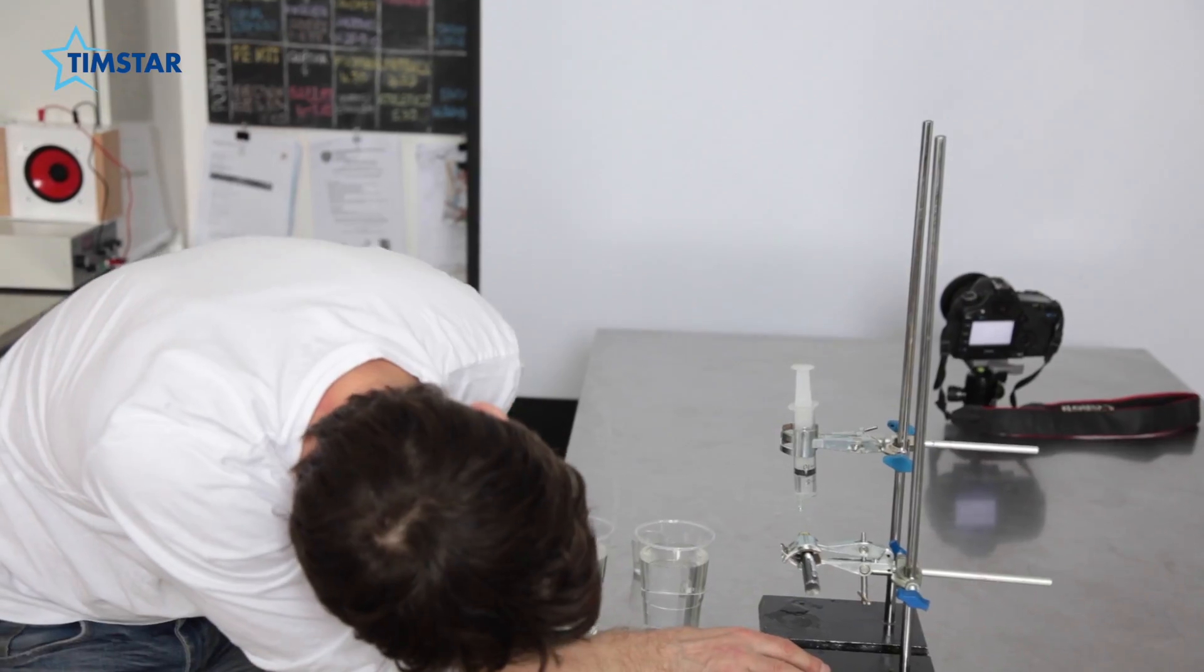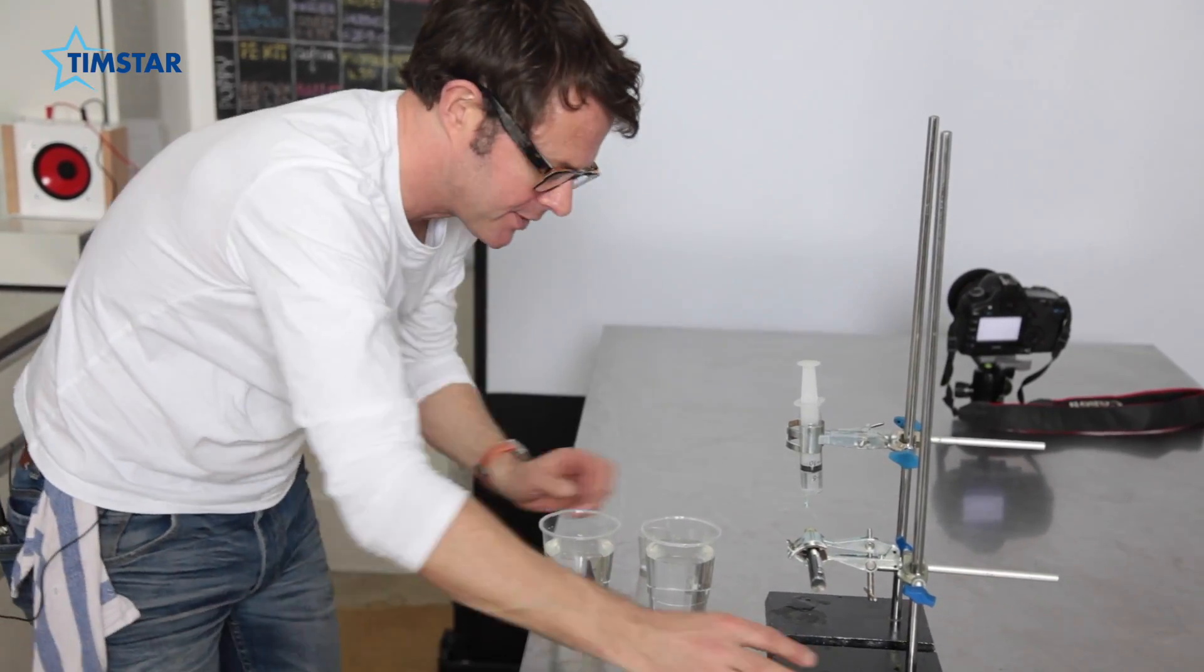Let's take a look at a few different little solutions and see if we can see anything else interesting. Okay, let's turn the lights off again. Let's see what we can see.